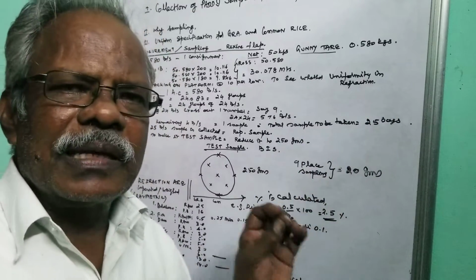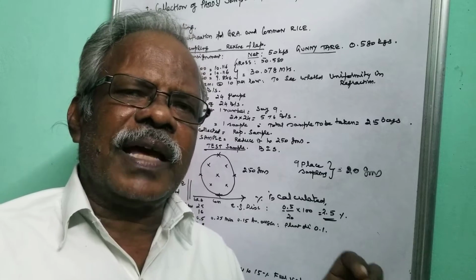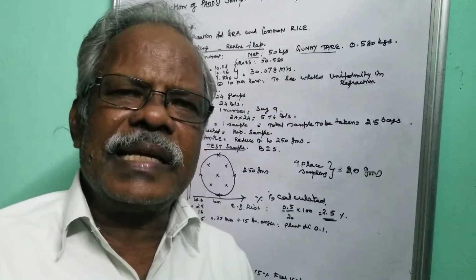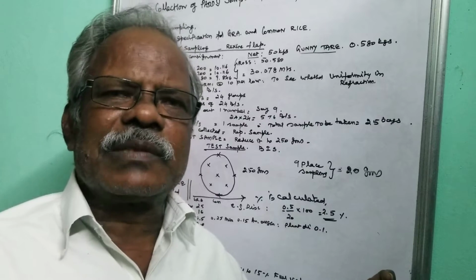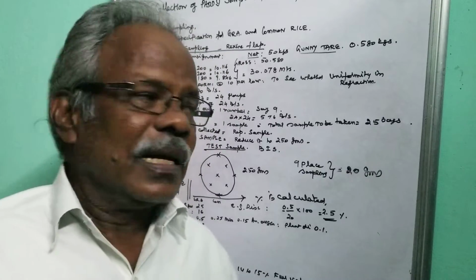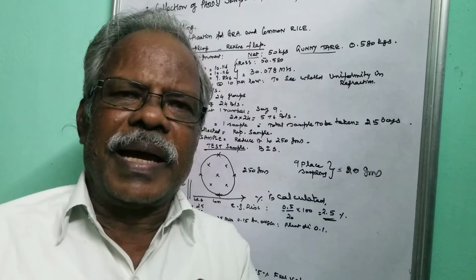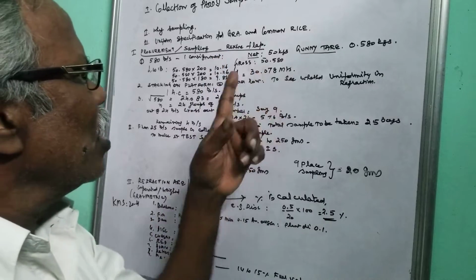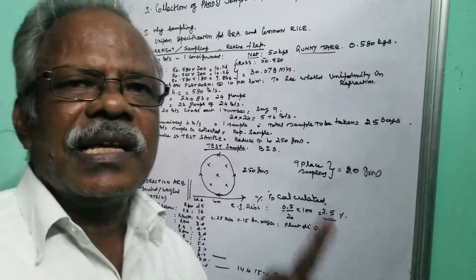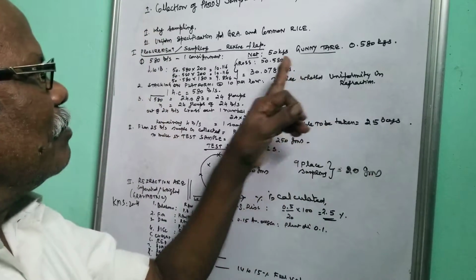Then the acknowledgement number will also be written on the bag by stencil. By taking the acknowledgement number, we can ascertain on what date it was procured. Everything can be traced. Moreover, usually 50 kg net weight is taken, and the gunny tare weight is added. So 50 plus the tare weight is the gross weight.